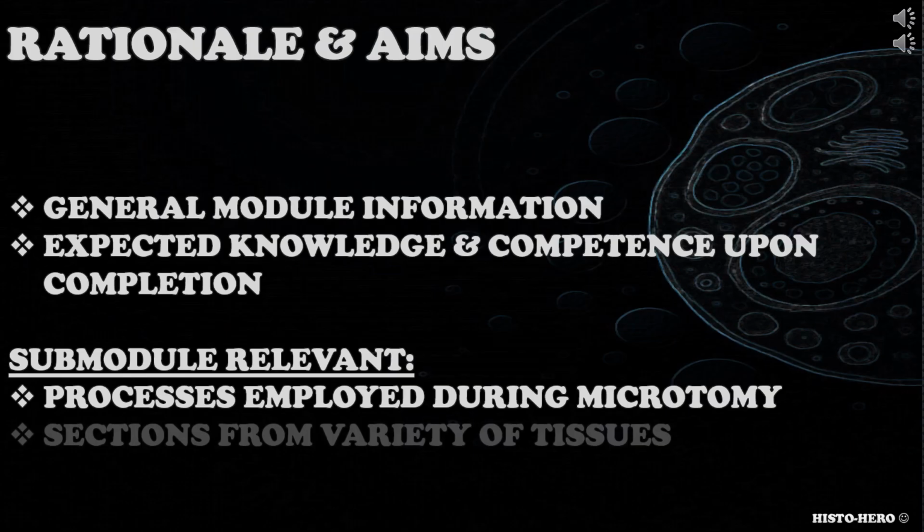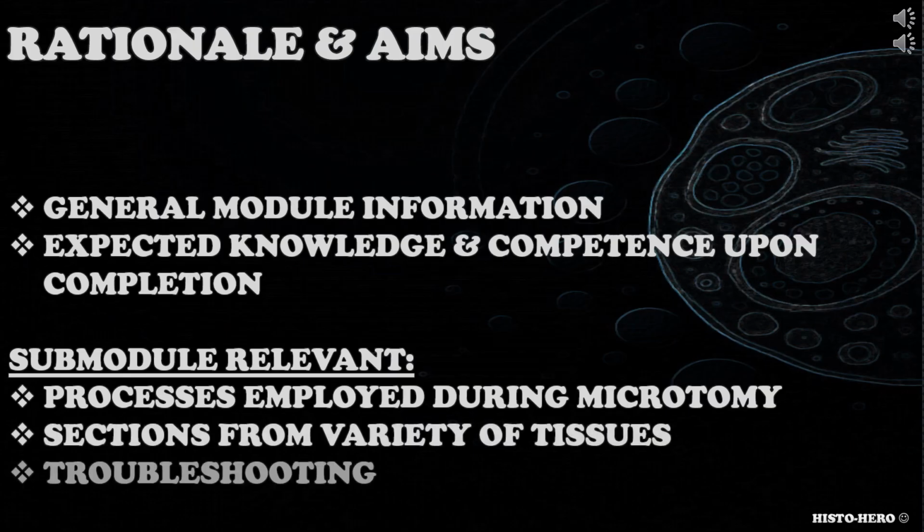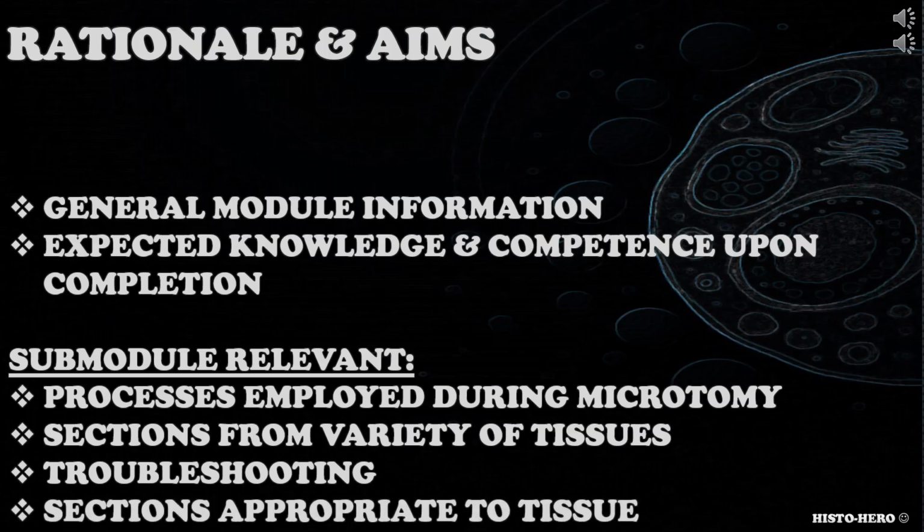Produce suitable sections from a variety of tissues. Use their knowledge and understanding to recognize and remedy common faults. Produce sections appropriate to the tissue and pathology under investigation, for example, appropriate section thickness, use of coated slides, taking unstained sections for later use.